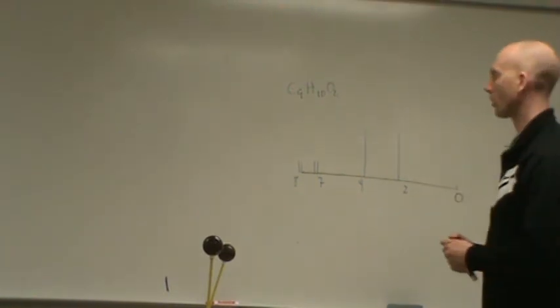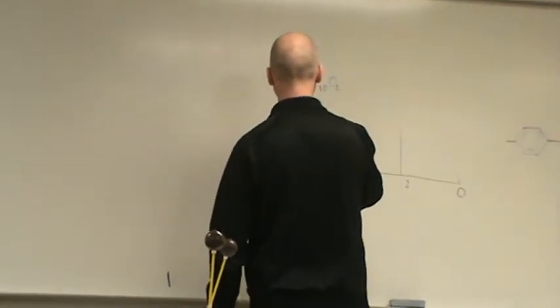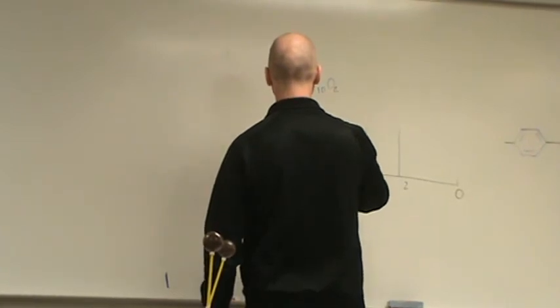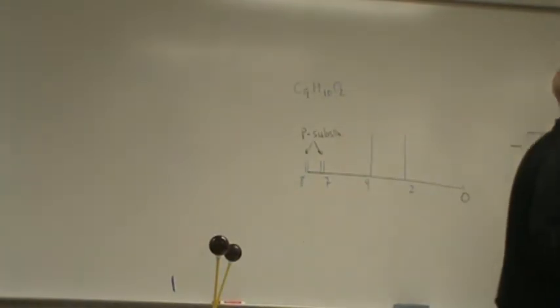That I have para substitution. Okay, so that tells me I have 2 groups on the benzene ring that are para from each other.